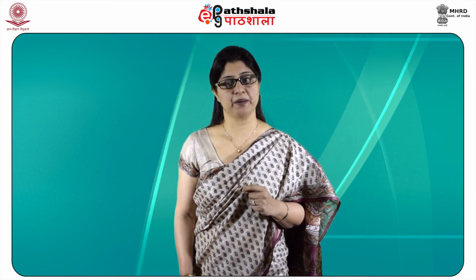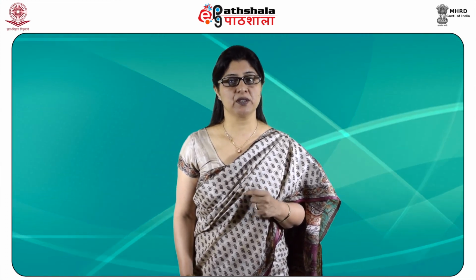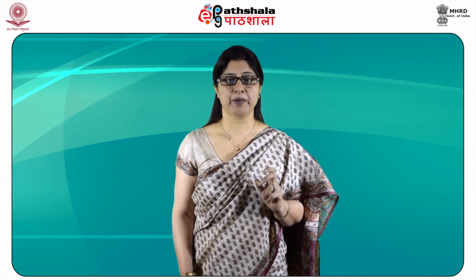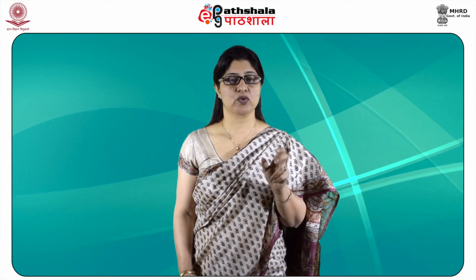Two triplets at 2.4 to 2.7 ppm indicate the presence of a CH2 unit, which in turn is attached to an electron withdrawing group, with an electron withdrawing group on either side of CH2 and CH2. A 3 proton signal at 2 ppm indicates a CH3 functionality attached to an electron withdrawing group. So finally, what we can see is an electron withdrawing group along with the CH3 group.